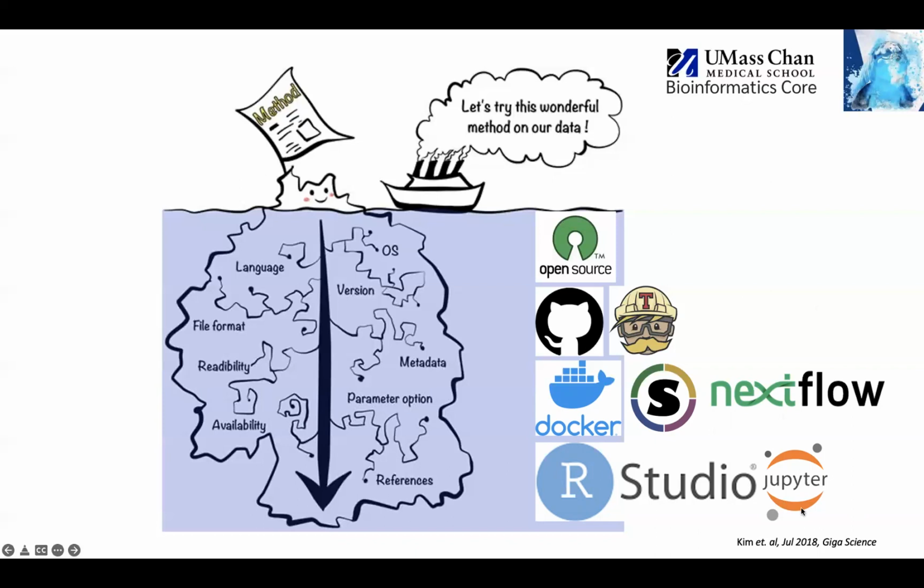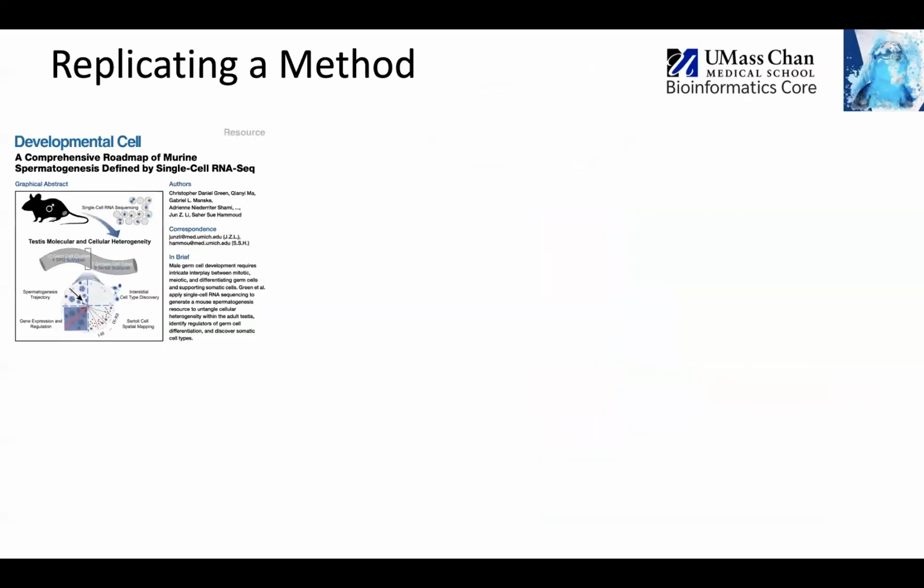part. After you process, you're still going to use all the software here using our interfaces in Dolphin Next, but you can focus on RStudio and Jupyter to learn and to tweak the data and to create your own plots and play with your data.